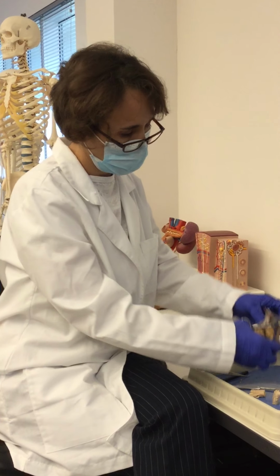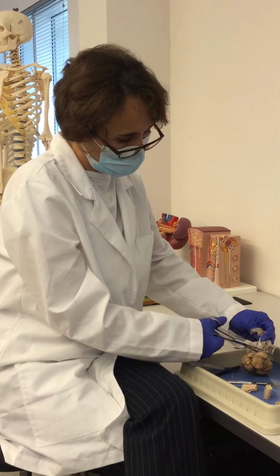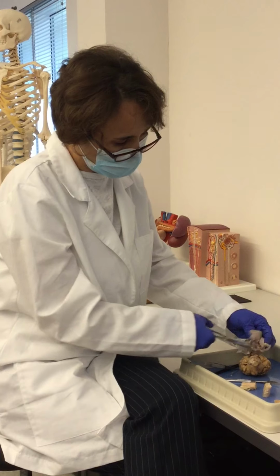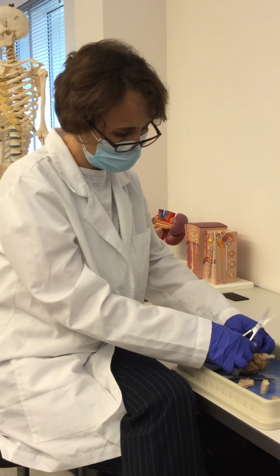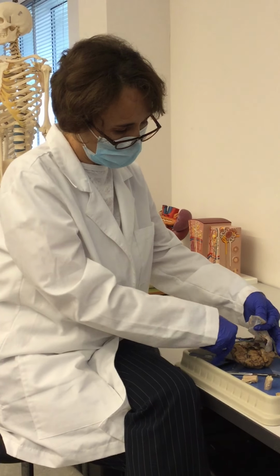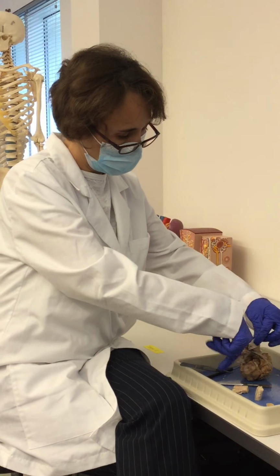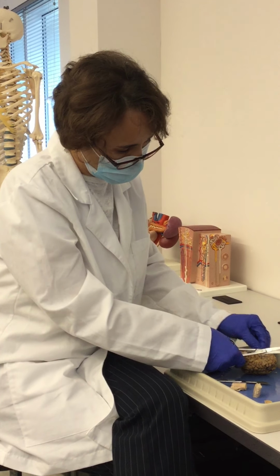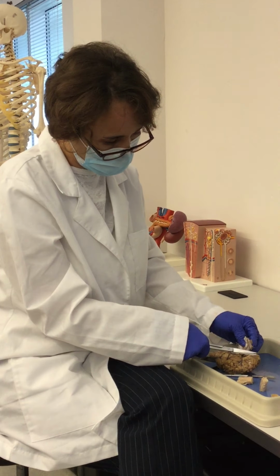Okay, so see, this is the dura mater, and when it comes here to the base of the brain, just be careful when you're separating it, because you can tear out some of these structures like the cranial nerves, so you have to be careful. And I'm going to cut the excess and try to see what we have of attachment in here.